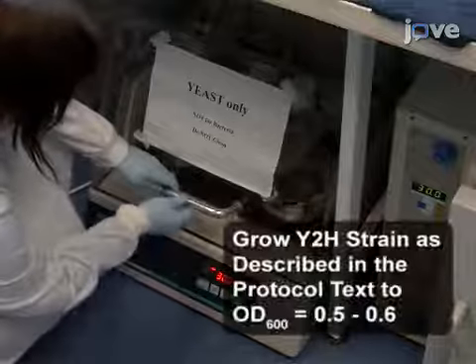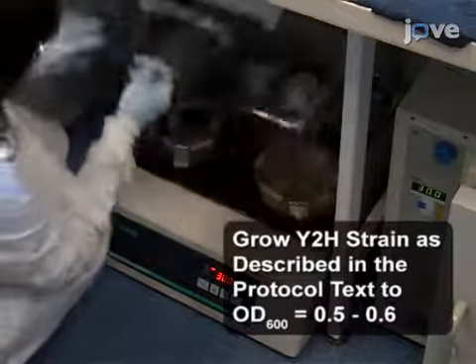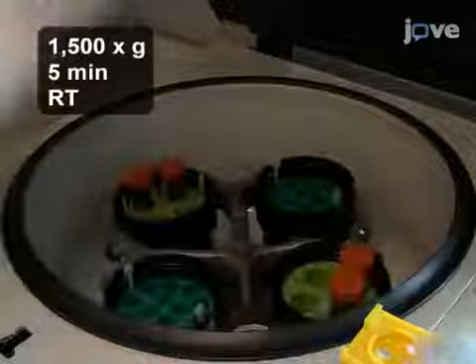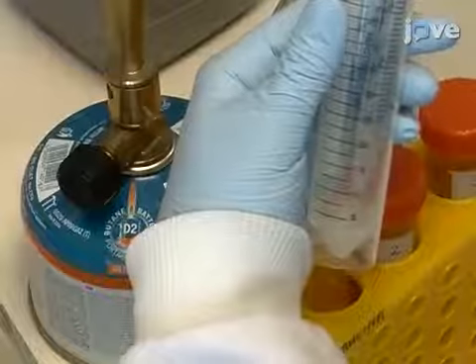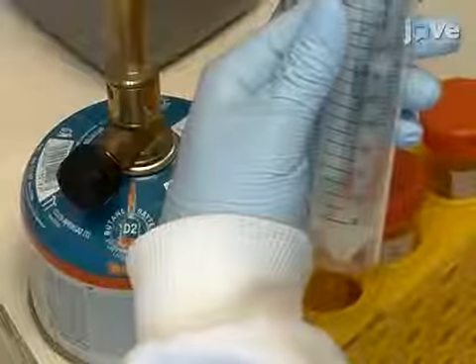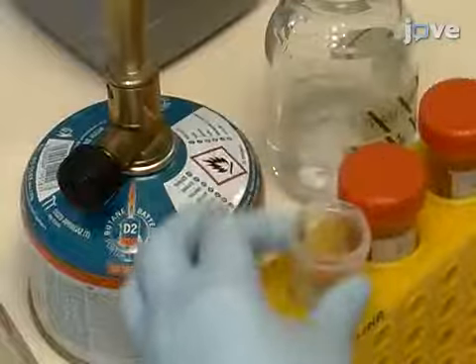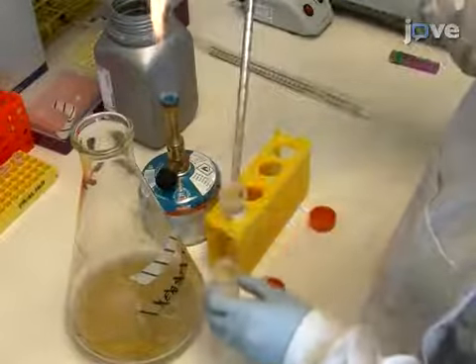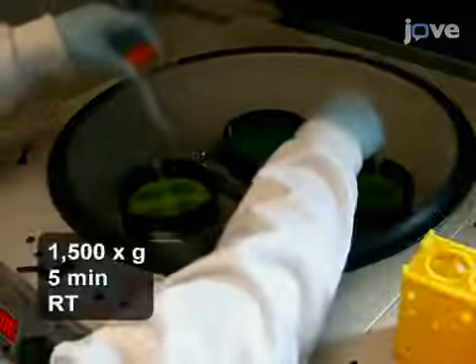In this yeast-2 hybrid assay, yeast cells in mid-log phase are used for transformation. Harvest the cells by centrifugation. Resuspend each pellet in 5 milliliters of sterile water and pool the cell suspensions. Centrifuge the cell suspension.